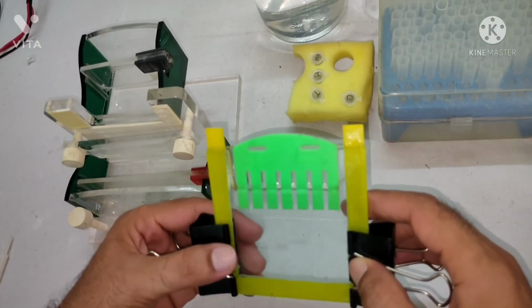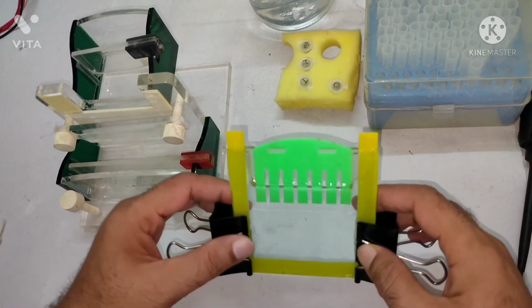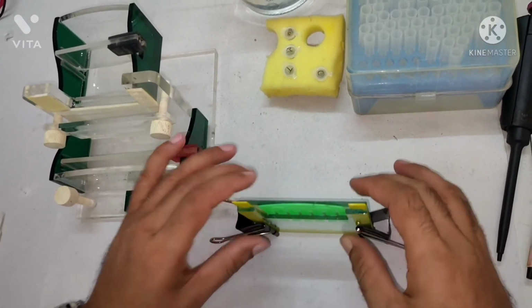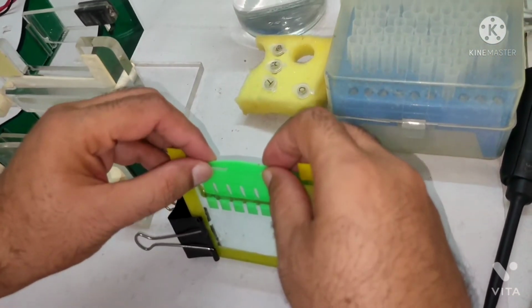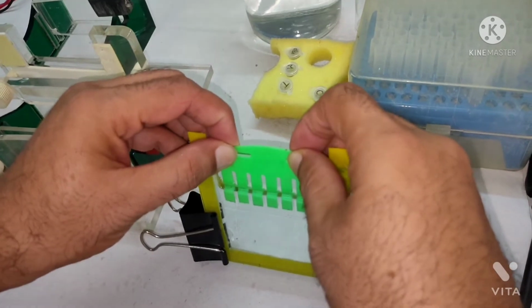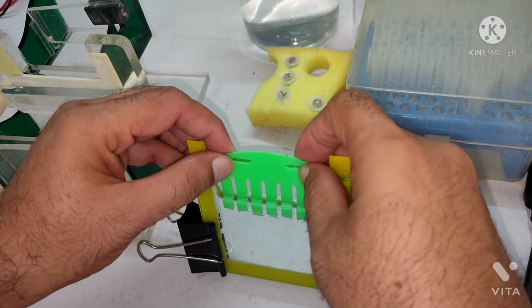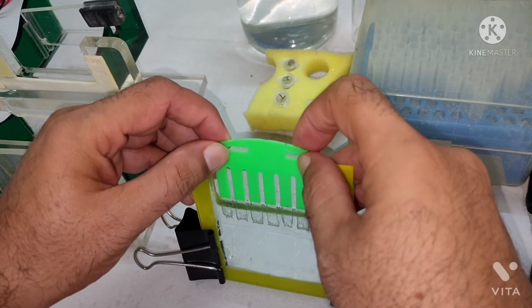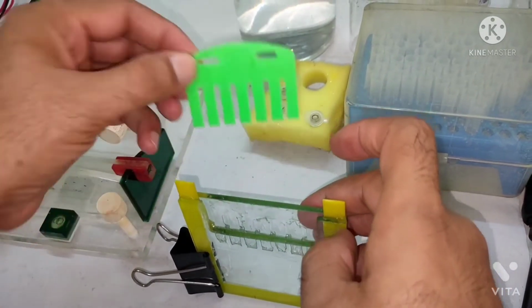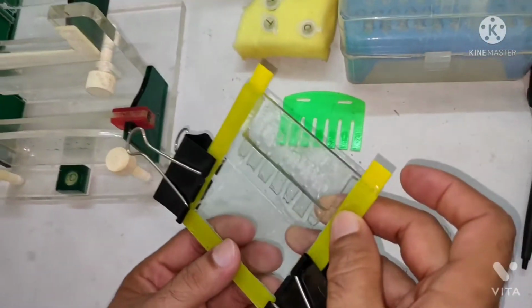See, now our gel is ready. Now we slowly remove the comb first. So I'm removing the comb, and you should remove it very slowly. Okay, now our wells are ready.